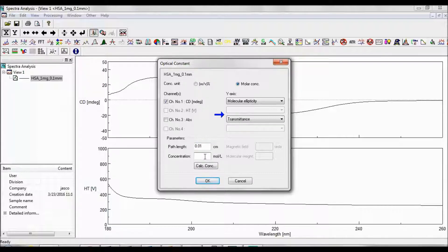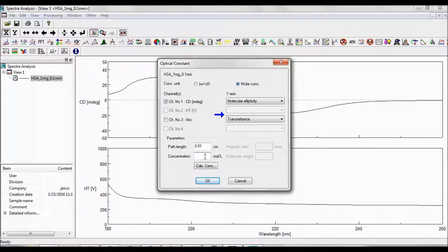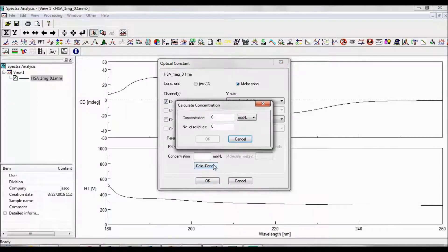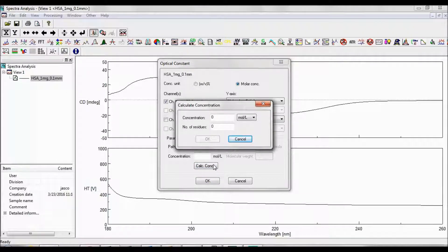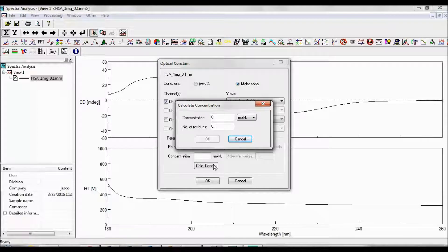If you do not know your sample's mean residue concentration, click Calculate Concentration. Now enter the molar concentration of your sample and the number of amino acid residues per protein.